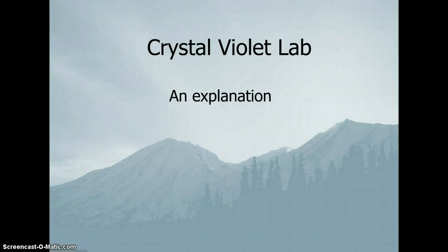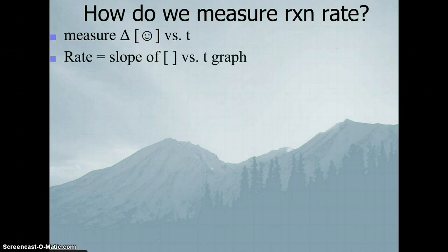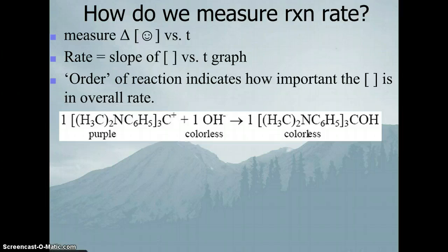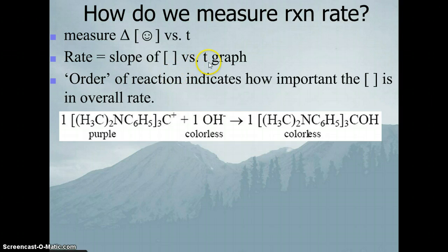Here we're going to discuss our experiment determining orders of reaction and rate law for crystal violet decomposing with sodium hydroxide. When we are measuring reaction rate, by definition we measure the change in concentration versus the change in time. To determine the rate of reaction, it's the slope of a concentration versus time graph — by definition, that is equal to the rate.